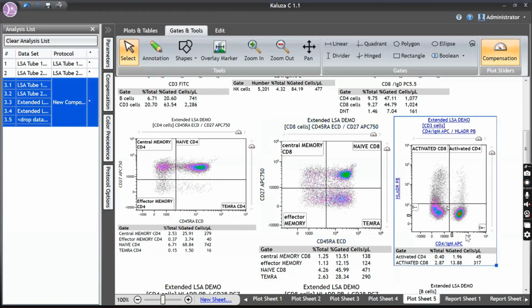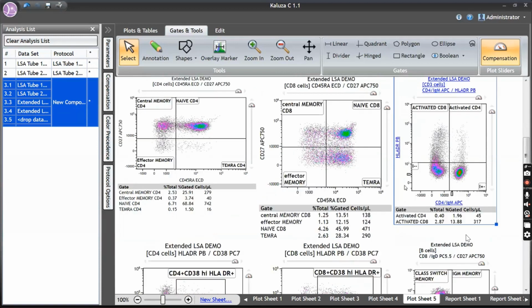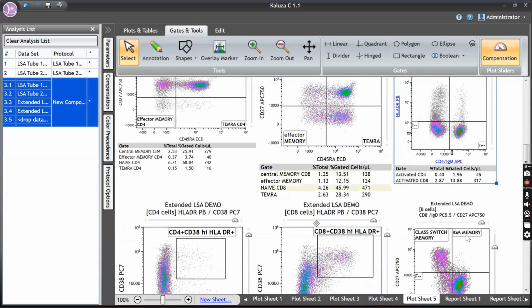And this is another case. So HLA-DR, I told you, normal T cells should show only a small tail of HLA-DR positivity. If you want to check the percentage, only 1% of activated CD4 is there, and similarly, normally CD8 shows more activation, so it's 13%. When this becomes reversed, where you get this cluster here and a very small population is HLA-DR negative, and similarly the reversal way you get, that is how you diagnose Omenn syndrome. So that is one way of diagnosing Omenn syndrome.